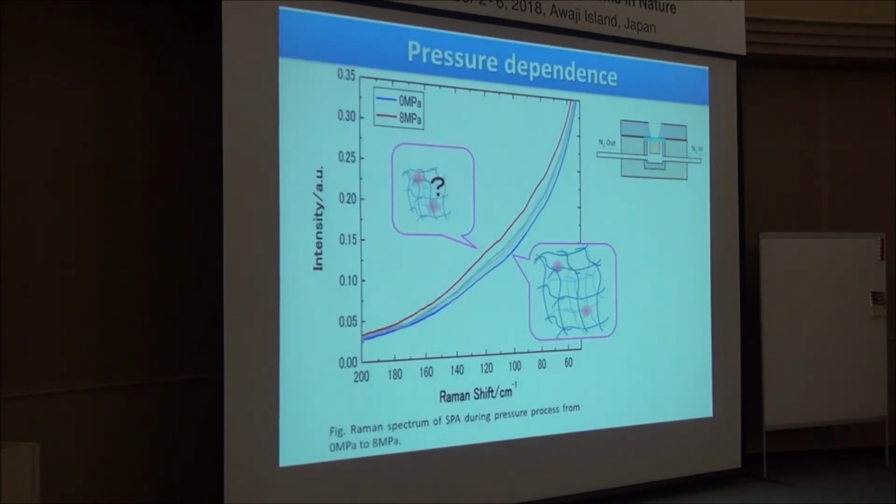Finally, I'd like to show the pressure dependence of the SAP. This is 0 megapascal and 8 megapascal pressure applied to the SAP polymer with water.